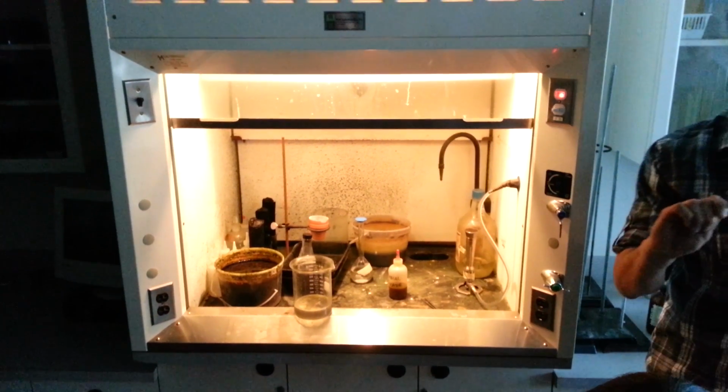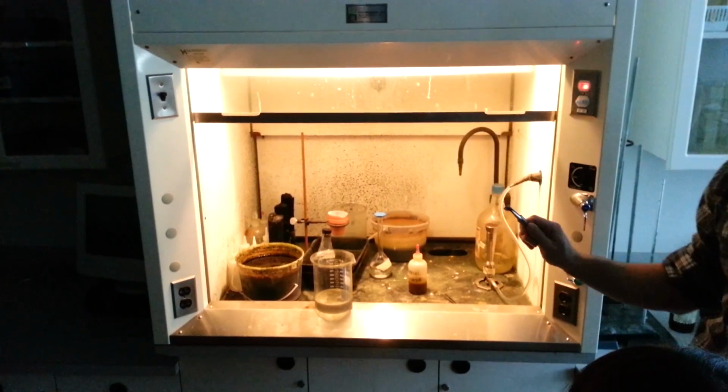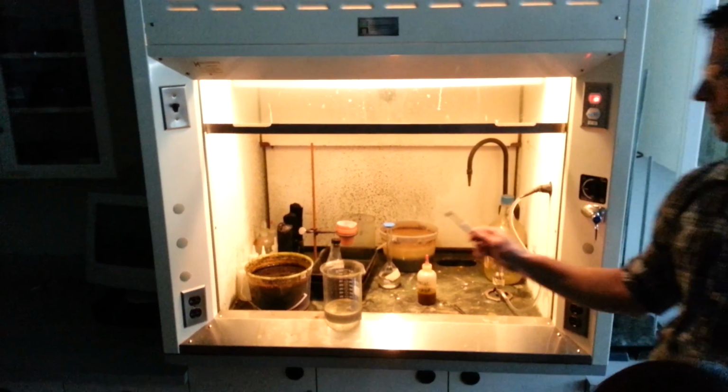And you okay with me putting this one in, even though that one's not finished? Okay. Yes? Let's do it.